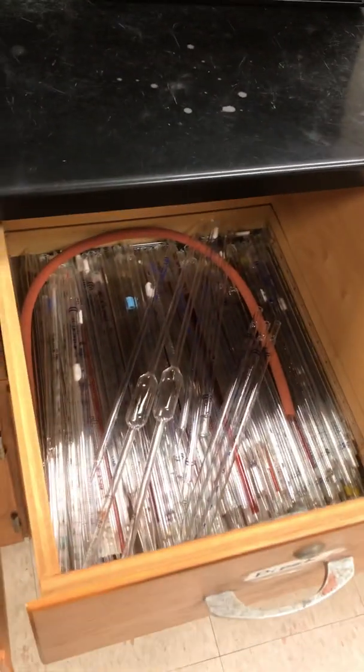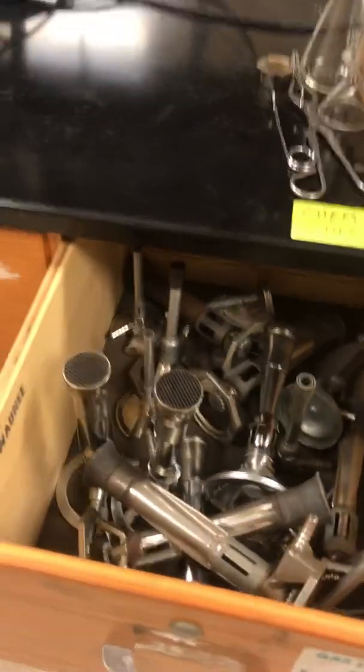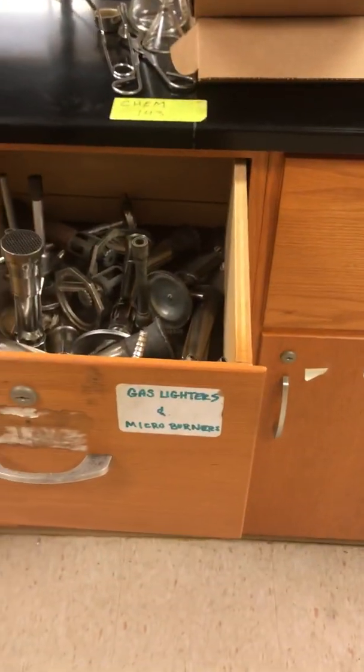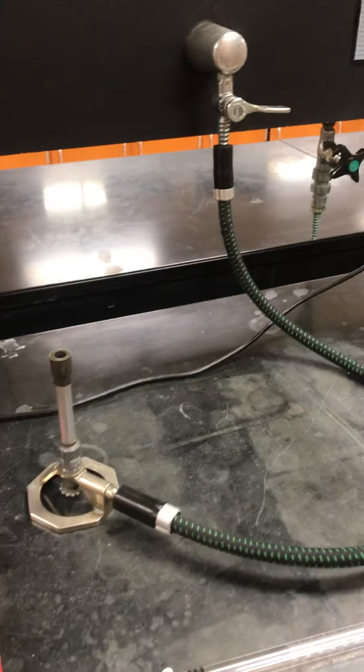In terms of your pipette ball and your pipette, the drawers are labeled pipette ball and pipette where you will obtain those. Also, you're going to have other drawers labeled gas lighters and Bunsen burner hoses.